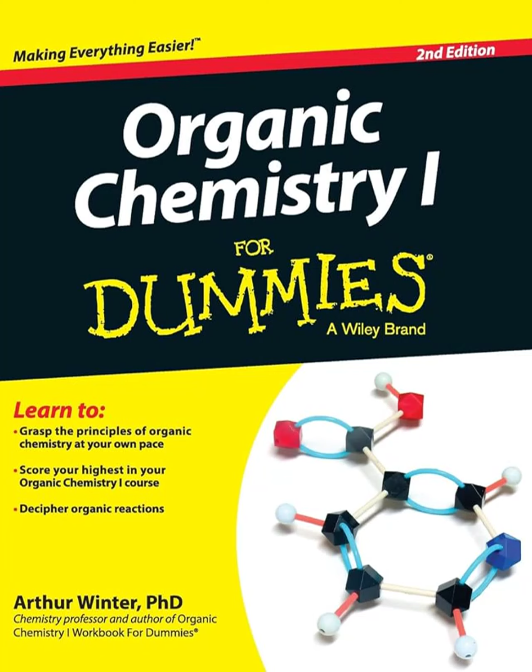So how do we start? Where do we look first on the spectrum? Okay, the standard approach is to first use the CH absorptions, which typically appear in the region from about 2800 to 3000 inverse centimeters. Use these as a kind of baseline or frame of reference. Why CH? Because almost every organic compound you'll encounter has CH bonds, so these signals are nearly always present. And even though individual CH stretches are relatively weak in terms of dipole change, a typical organic molecule has so many CH bonds that their overall absorption usually appears quite intense, as a jumble of peaks in that 2800 to 3000 range.